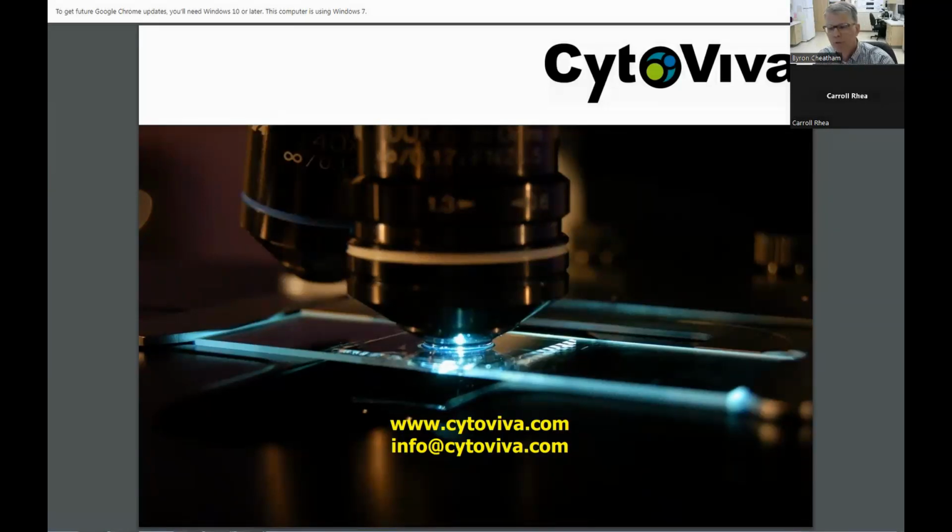However, not always. For example, we were working with a group this week that works on silica substrates with a film on it. And in that scenario, the substrate with the film is very homogeneous, and you could normalize against that substrate as well. So it's not just exclusive to the lamp. In the silica and tissue example, we normalized against the tissue. So there's a couple of options that you can use there, but most typically it is against the lamp.